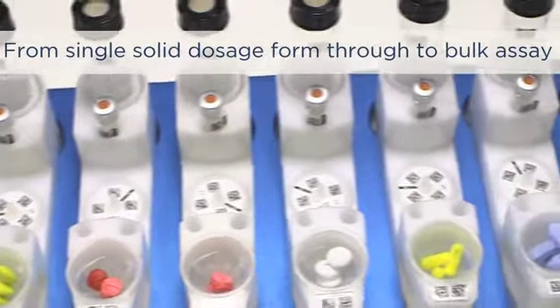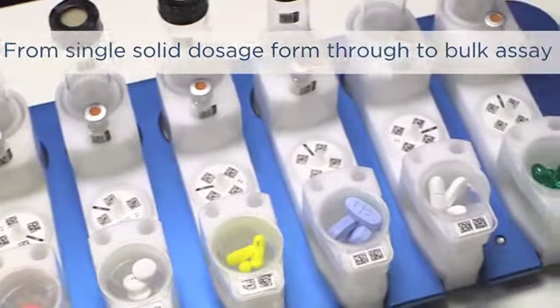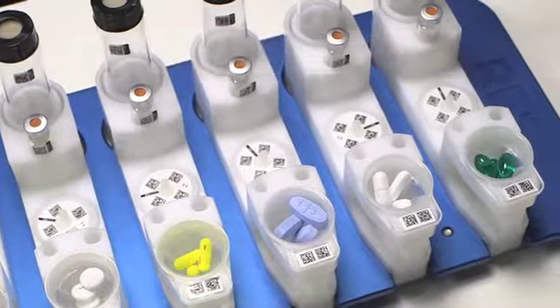Methods also exist for tamper-resistant formulations, such as PEG, and prolonged-release gel formulations, such as HPMC.